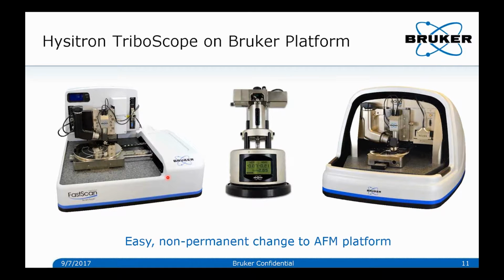The Hysitron TriboScope goes on to the various different Bruker AFM platforms. I'll show an example of how to mount this on the system. It is an easy, non-permanent change to the AFM platform. So it works with the small sample or the multi-mode AFMs as well as the large sample Dimension or Dimension Icon AFMs.